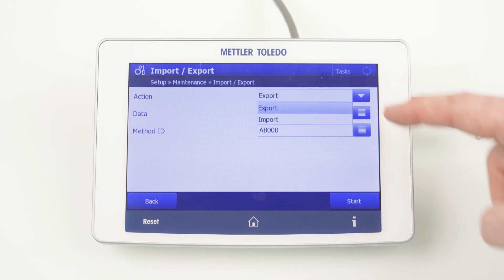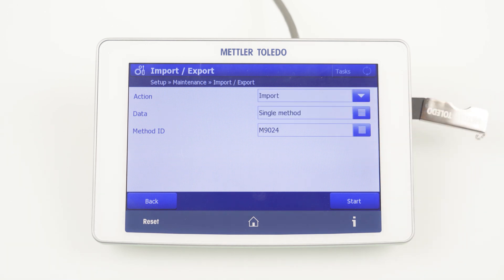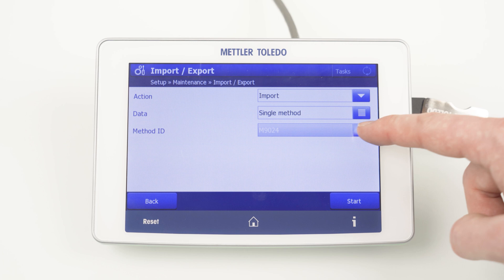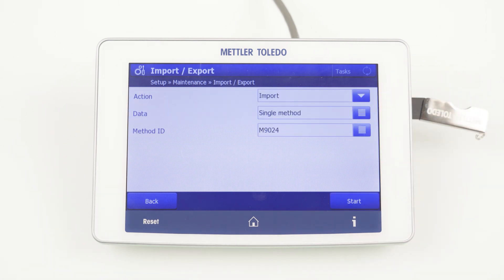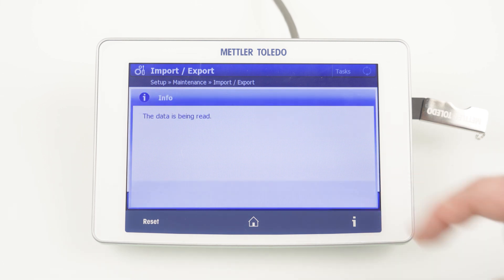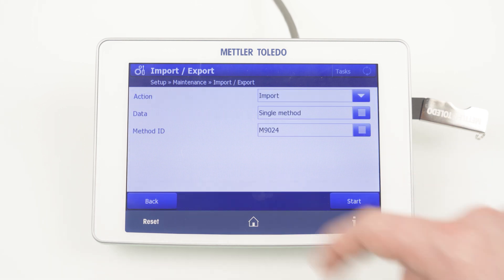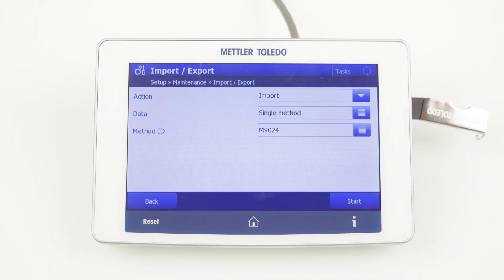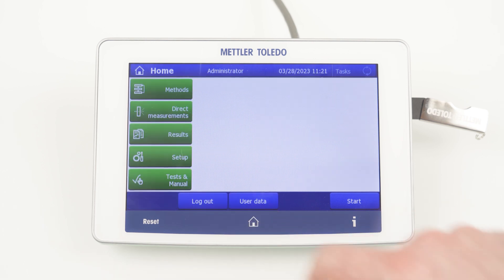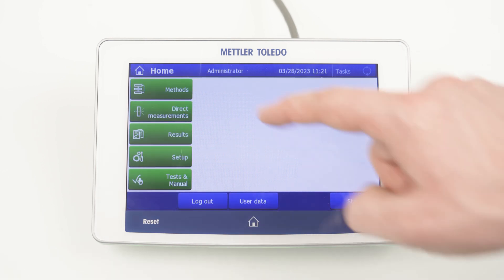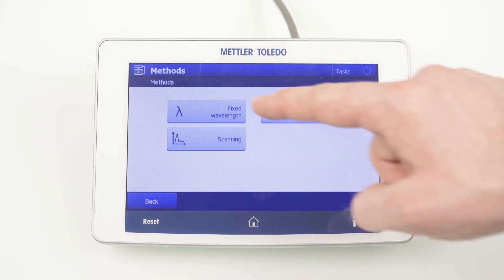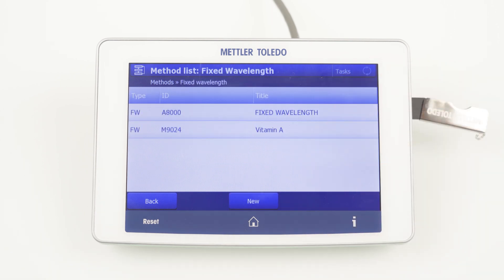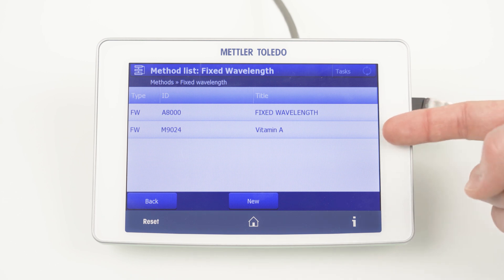After you have selected Import, you can choose the method from your connected USB flash drive. As there is only one method stored, you can select the method and click Start. After the successful import, you can go back to the home screen and select Methods — and in this case for Vitamin A, select Fixed Wavelength. And here is your imported method, ready to use.